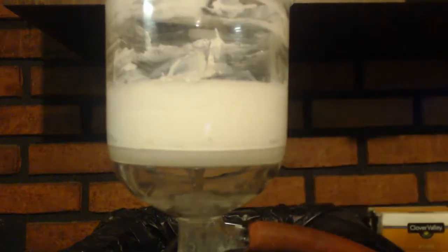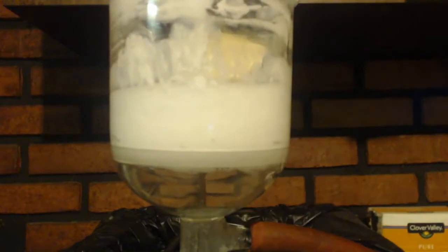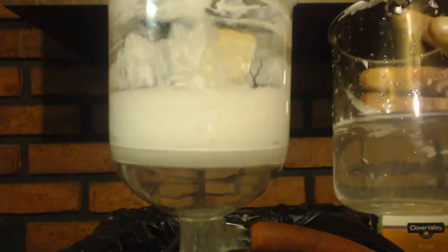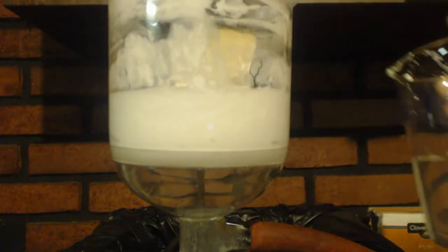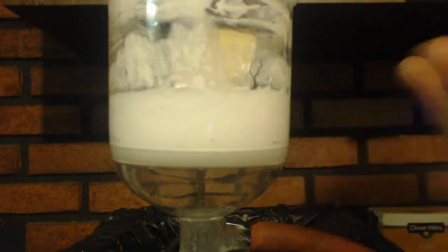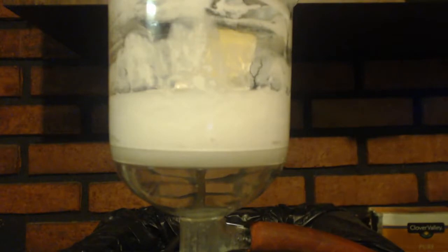Okay, so I'm going to suck all this water out, right? And then I'm going to add, you see I got some more in here. See there? Clean some more of that out. Total, probably I'm going to use about 400 to 500 milliliters, and put 100 milliliters in at a time. Stir it around, and then put a vacuum on it and let it get most of the water out. It's not going to be dry. It'll still be kind of like pudding. And I'll just repeat that until the water's gone, and that should make it clean enough.